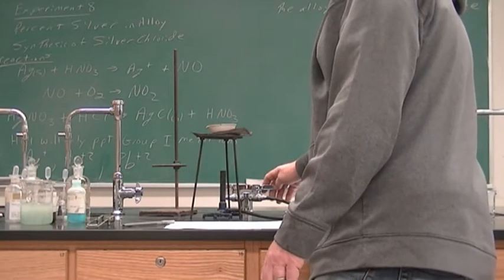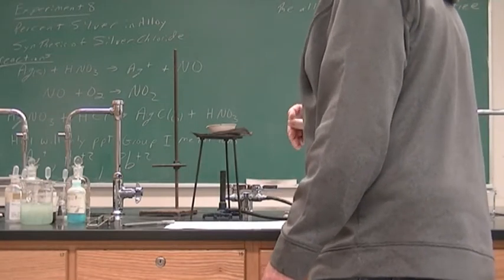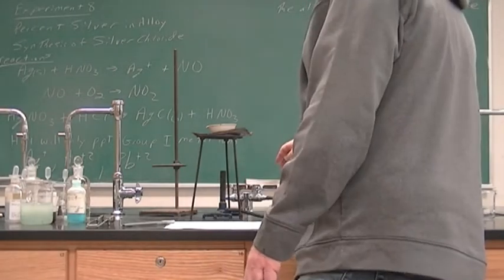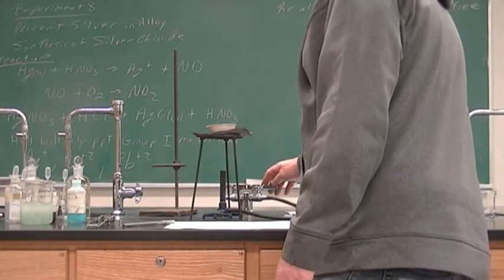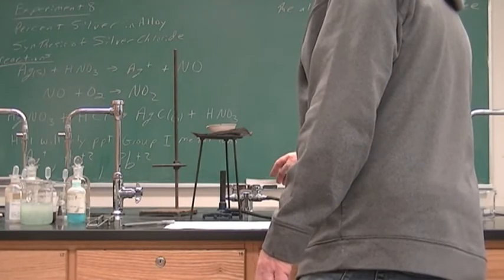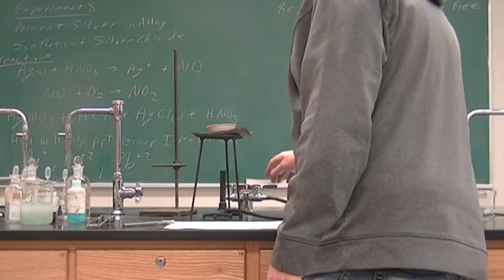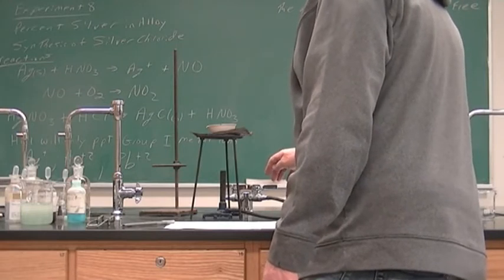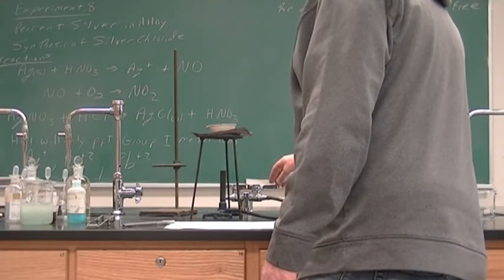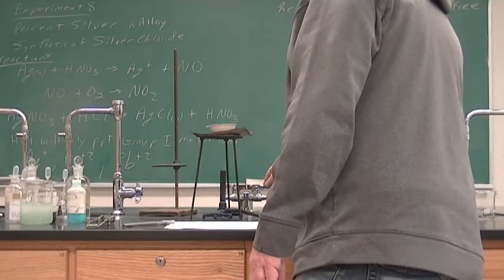Really gets low, that's when the popping really starts to be a problem. I can still hear it. All right. And finally, we have dry silver.